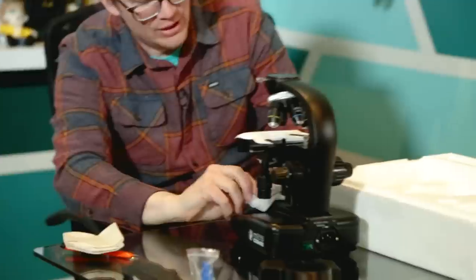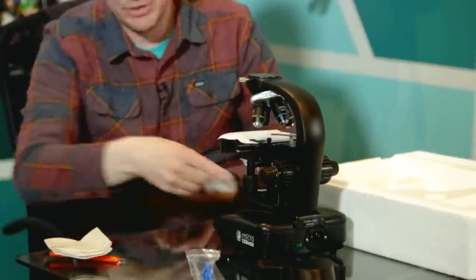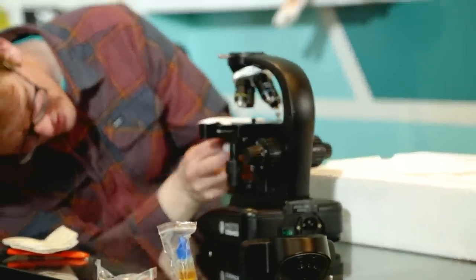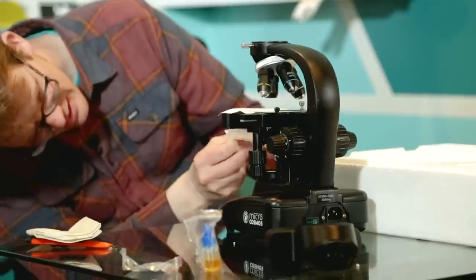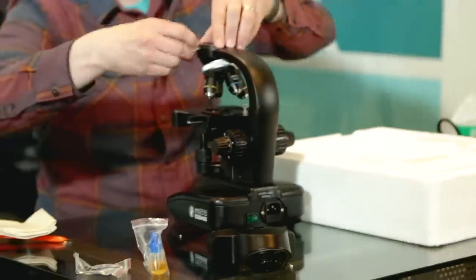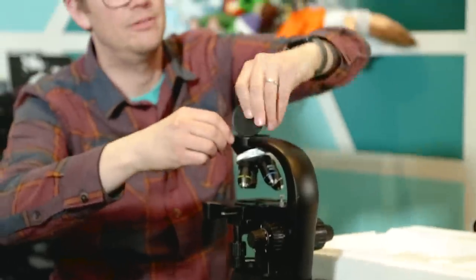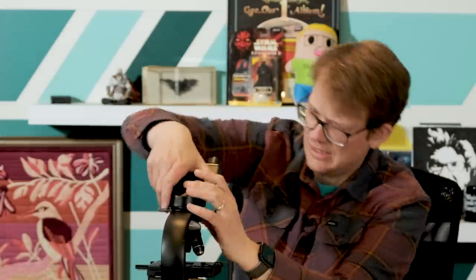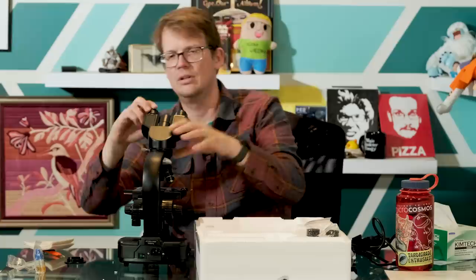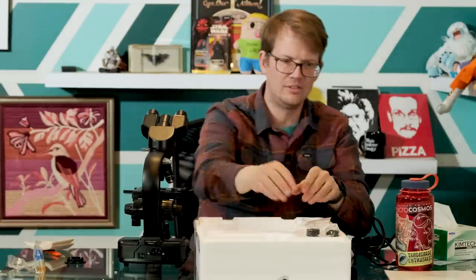Best part of buying something is taking all the little protective things off of it. You've got a little tissue paper covering the light source down there, a little tissue paper in this space for safety, and then a little tissue paper on the stage — that's what that's called. Twist this little piece, pop it off, slide this in here, and twist it back so it doesn't fall out. Then take out these little inserts because your eyepieces go in there.